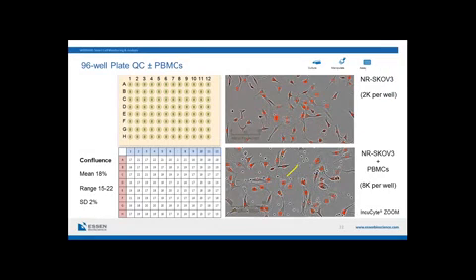So we then progressed with this purified cell population into plating these cells in preparation for our co-culture assay. We worked on 96-well plates, and our initial target by seeding the SCOV cells at 2,000 cells per well was to bring about roughly 20% confluence, or 20% area occupancy, across this plate. The data on the bottom left-hand side of this slide shows we did a reasonably good job here. On average, we had 18% confluence with relatively little variance from one well to the next, and this SD value of 2% was considered a good starting point.